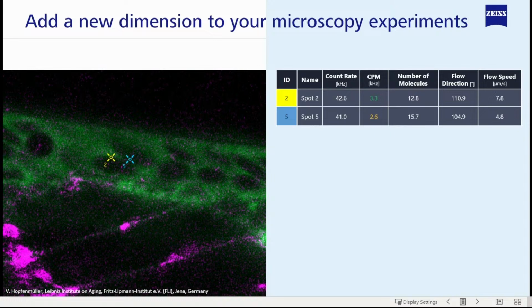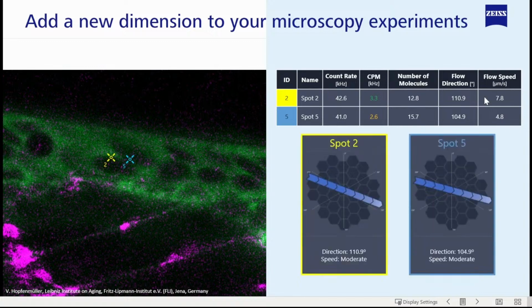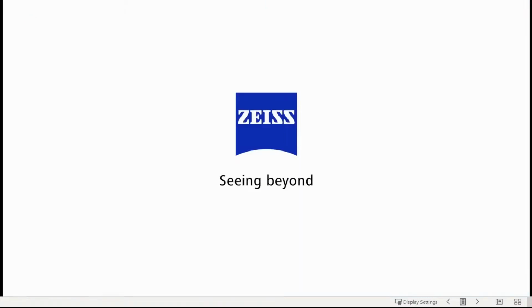In this example, you can see we have two spots measuring flow at different speeds in microns per second. And of course, again, you not only get the flow speed, but you're going to be able to see what direction it's actually going in. And of course, that does track here from the graphic on the left to the actual infographic on the right, showing the blood is pumping from left to right, which you would expect from the orientation of the fish. But you can now confirm all of that and get real measurements in your living organisms just using Dynamics Profiler.